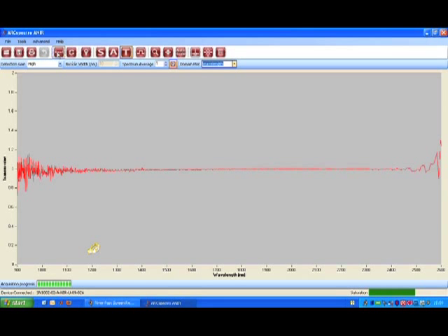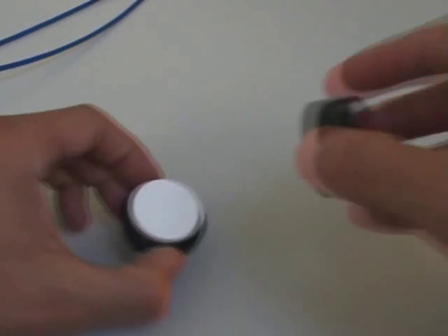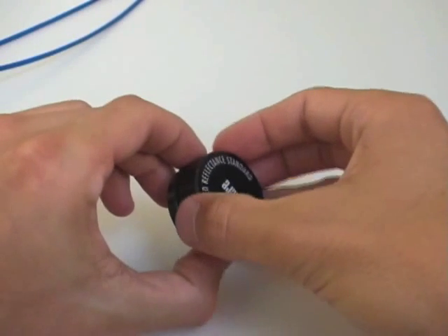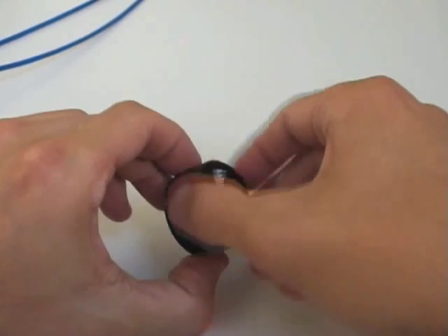Apart from noise, your transmission line should stay flat. We're now finished with the white reference standard, which you can safely store back.